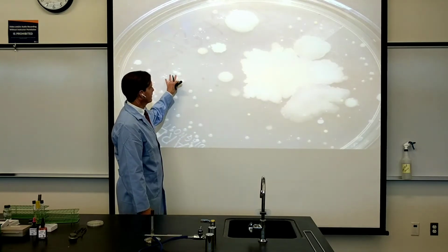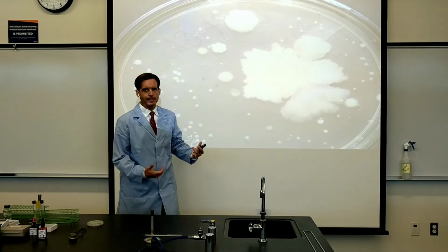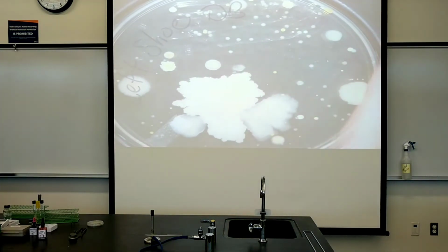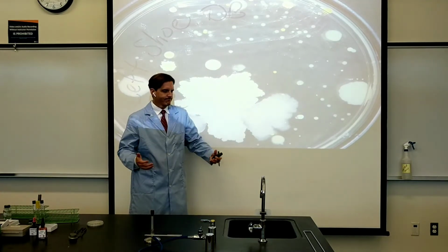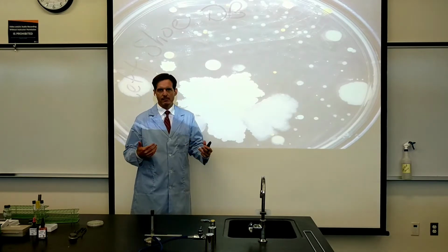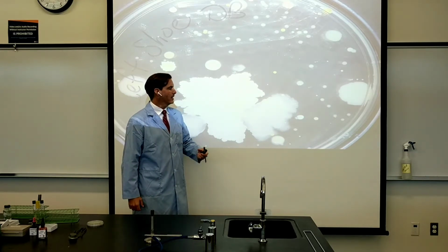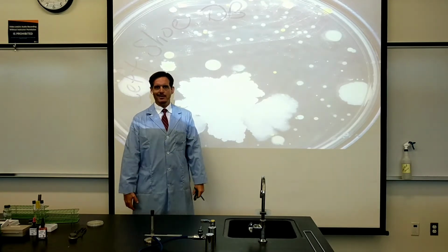The organisms that are off-white, small, smooth, round, regular in their appearance are usually skin bacteria. There are a lot of skin bacteria, even on the ground, even on the bottom of your shoes, because I don't know if you've heard this before, but it's estimated that in an environment where people live, the dust inside of human dwellings is like 70% skin cells.